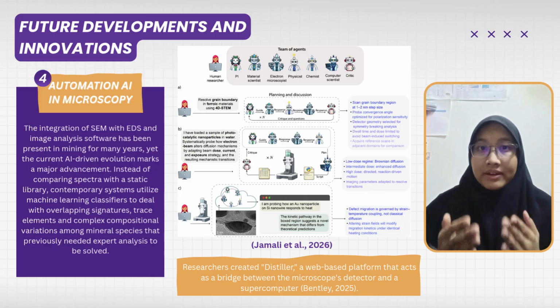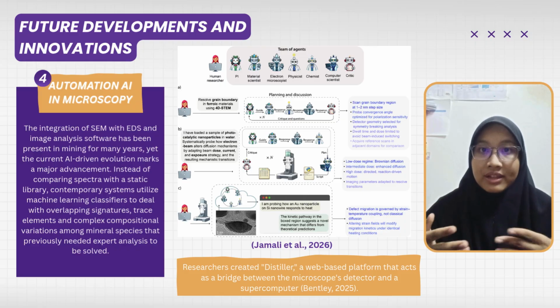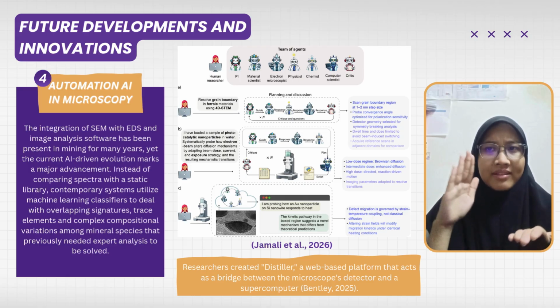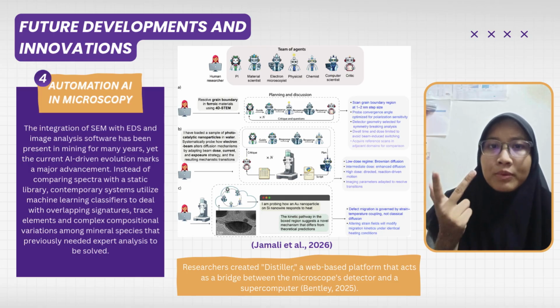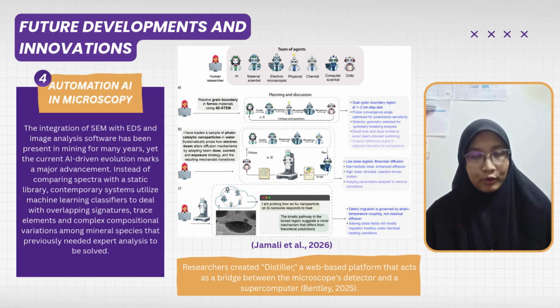Instead of comparing spectra with a static library, contemporary systems utilize machine learning classifiers to deal with overlapping signatures, trace elements, and complex compositional variations among mineral species that previously needed expert analysis to be solved.